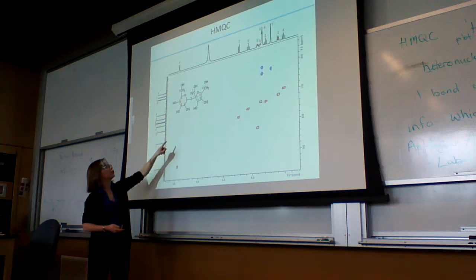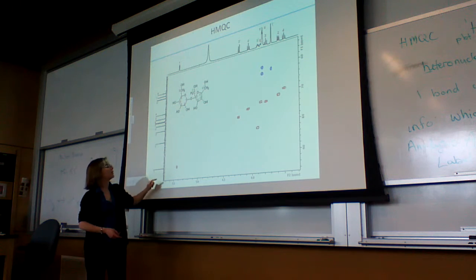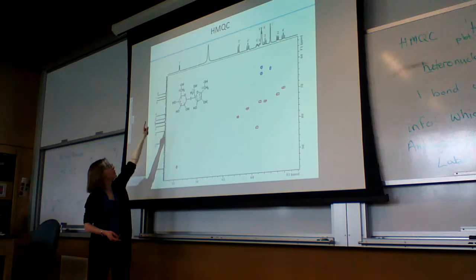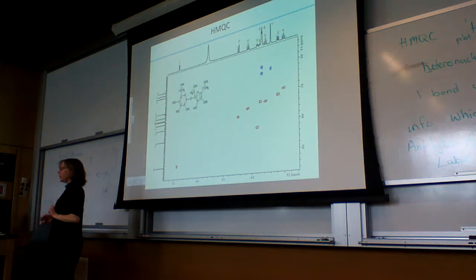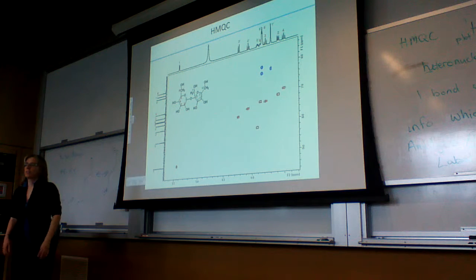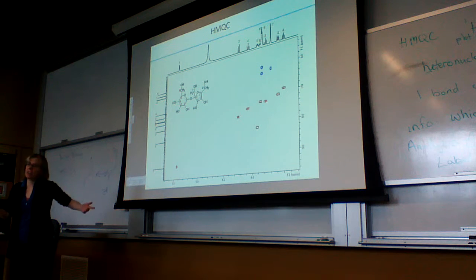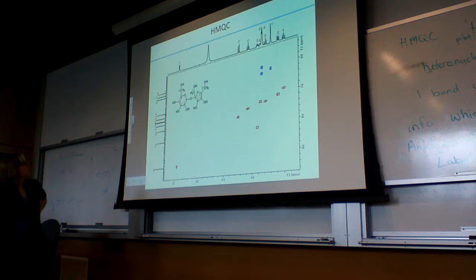And we've got your cross peak here. This is the hydrogen of the anomeric carbon, and you can see that hydrogen 1 corresponds to the carbon here. Which carbons are not going to show up here? If they don't have a hydrogen connected to them, if they're quaternary, they're not going to show up. So is it unique, like there's only one carbon that goes with every hydrogen signal? Not necessarily. I believe there's an example in here where that's not the case.